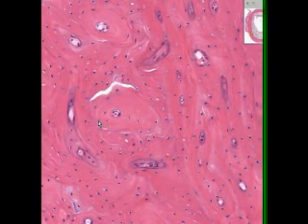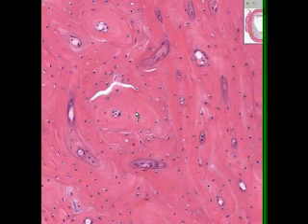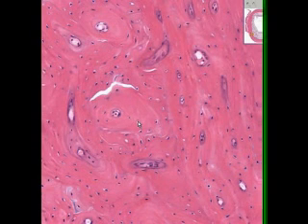And connecting between adjacent osteocytes, which we will see on another stain, will be smaller, tinier canals, which you can't see normally on this type of microscopy. You have to do a special kind of stain for it. Will be the canaliculi, which are the smallest, tiniest filamentous connections between adjacent or nearby osteocytes.